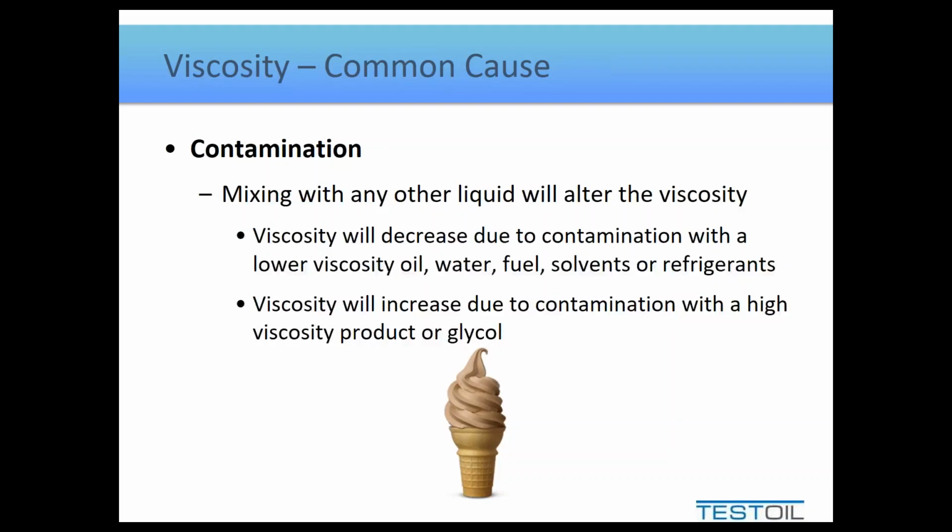Water doesn't always cause an emulsion. There are many products out there, particularly gear oils and engine oils, that actually contain emulsifiers to help handle the water content and not cause emulsions to form in the sense of with all the microbubbles in them. Other oils out there, like turbine, compressor, and high-speed pump oils, may contain demulsifiers in them to help keep the water separate. When the water is kept separate, it forms very small droplets. It doesn't tend to form an emulsion, and again, doesn't trap air bubbles.